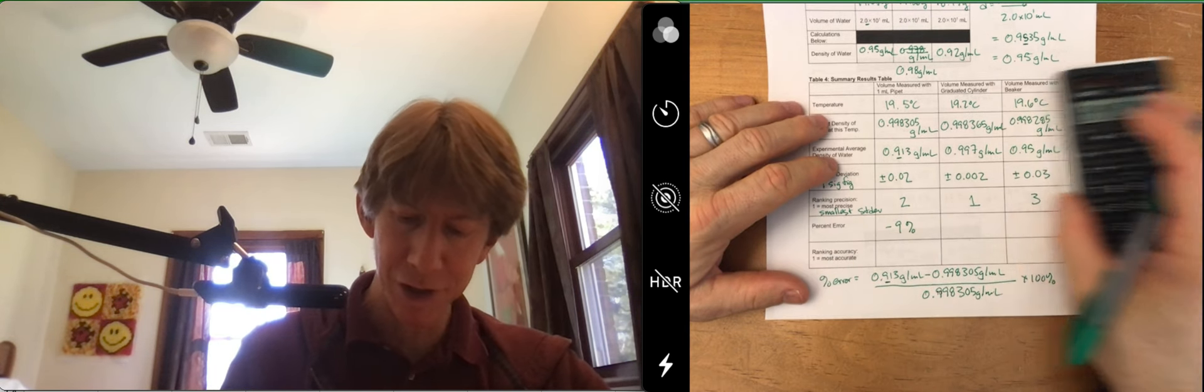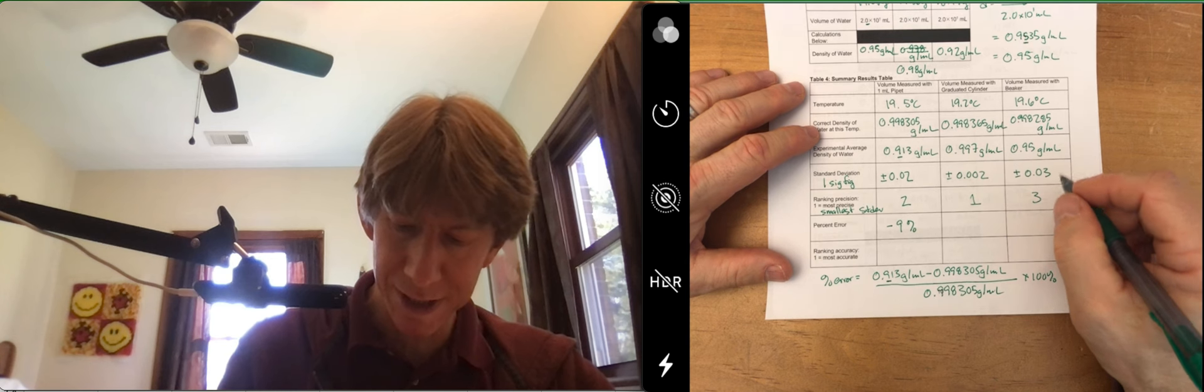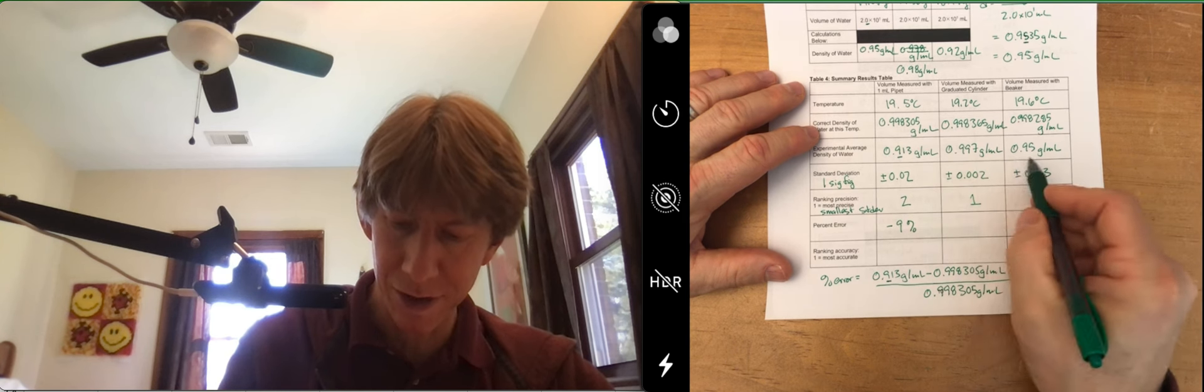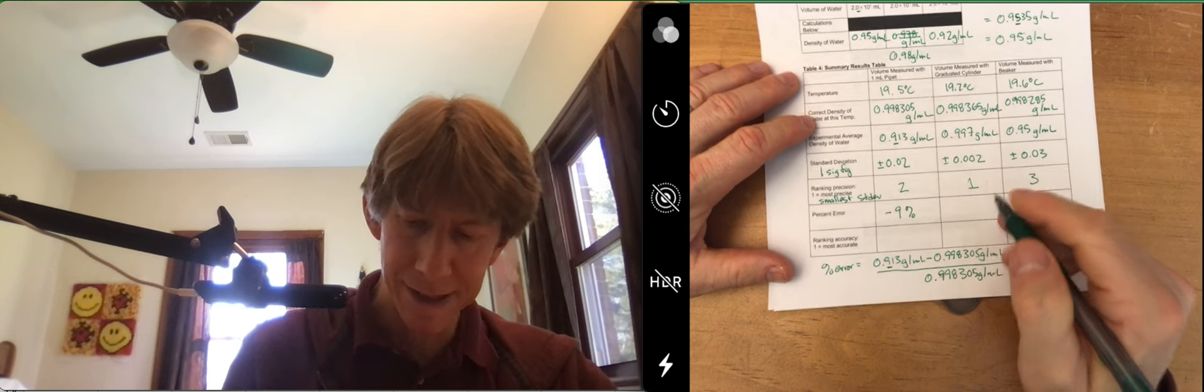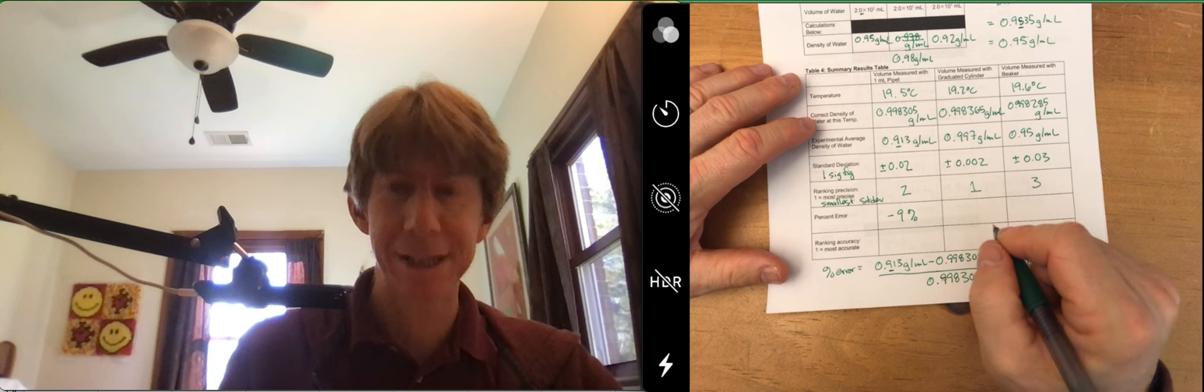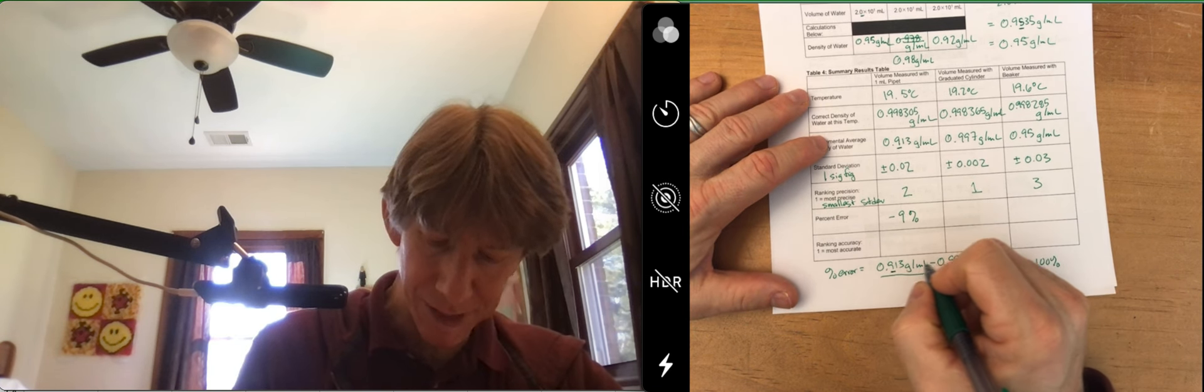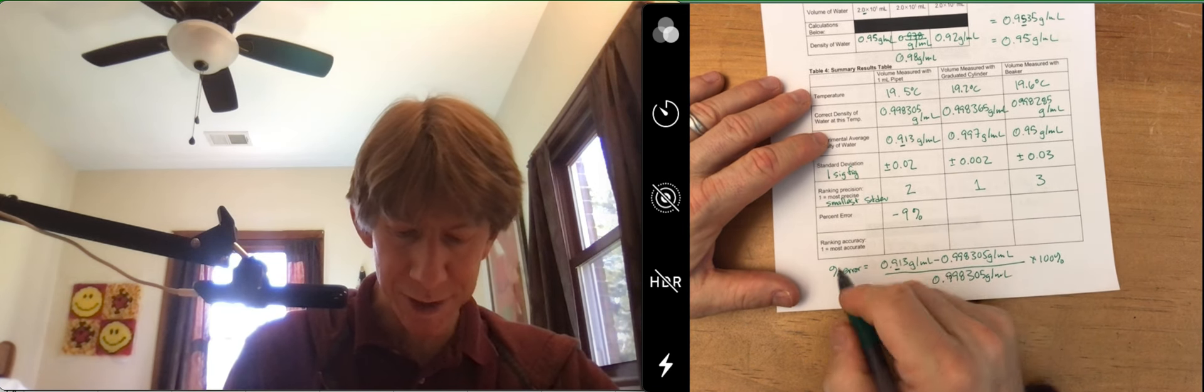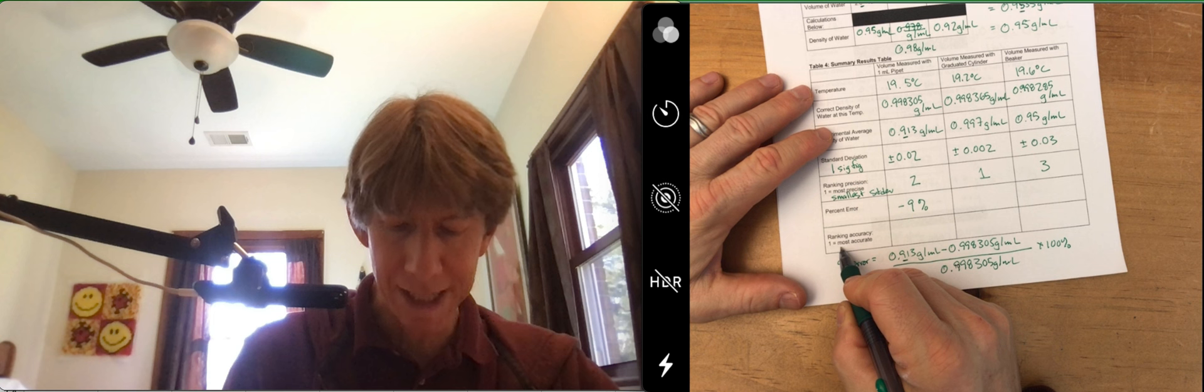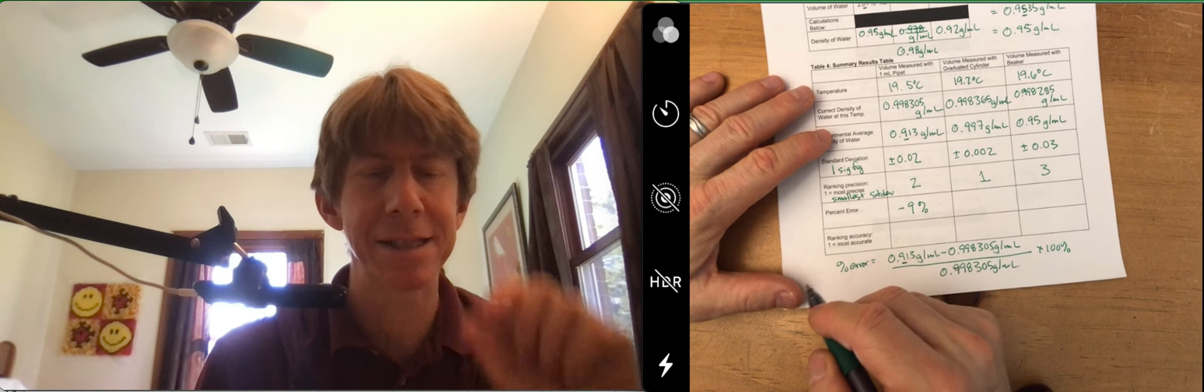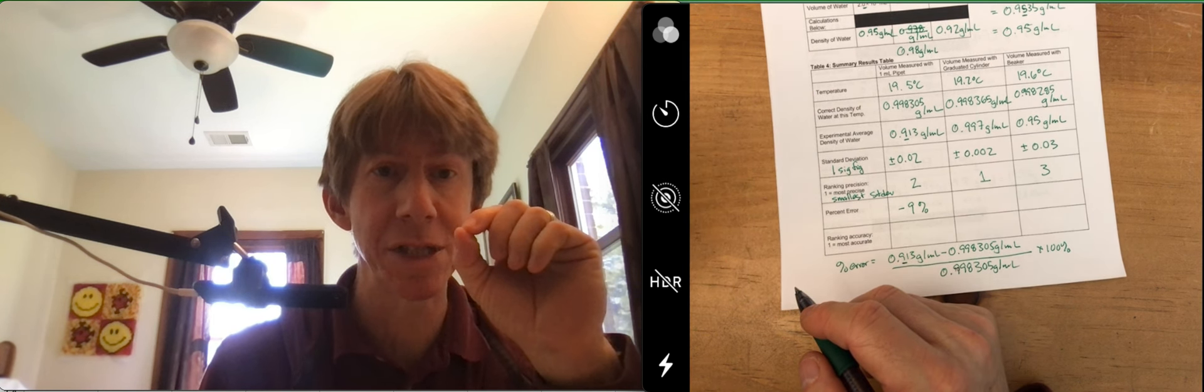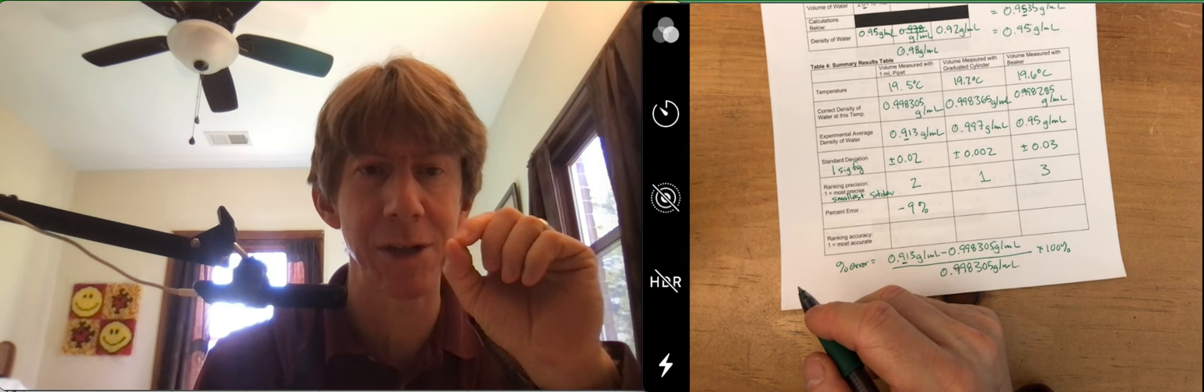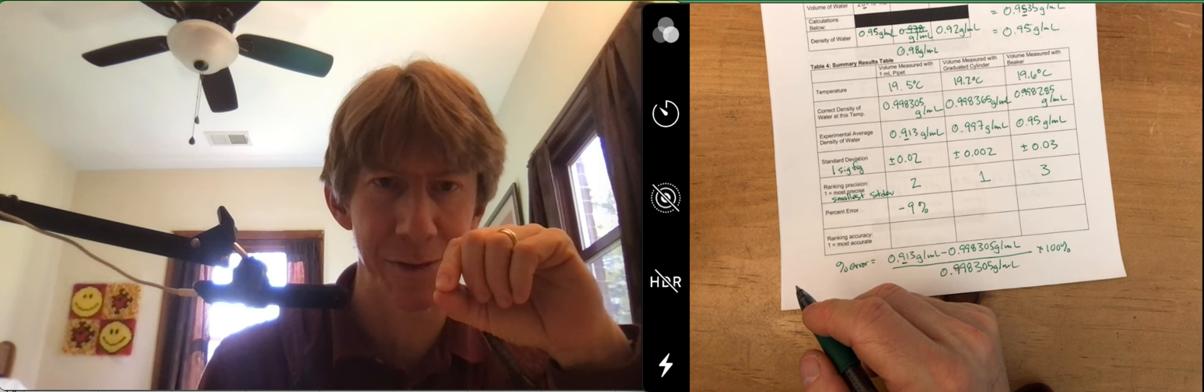And for the other ones, I can assure you they're going to be smaller because these values are closer. And what I would find is that, so as far as most accurate, the most accurate has the percent error closest to zero, either positive or negative.